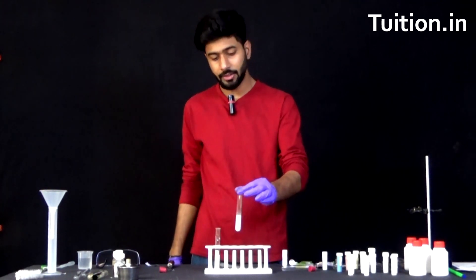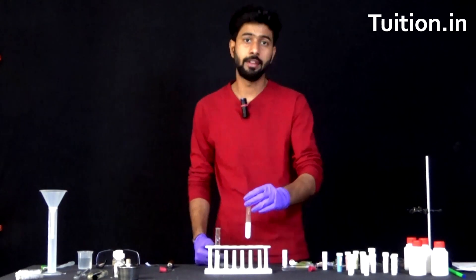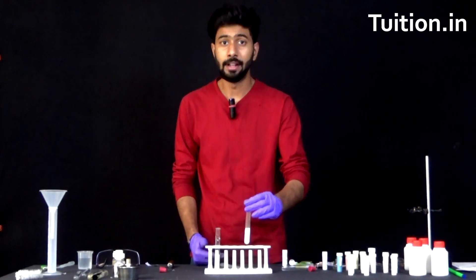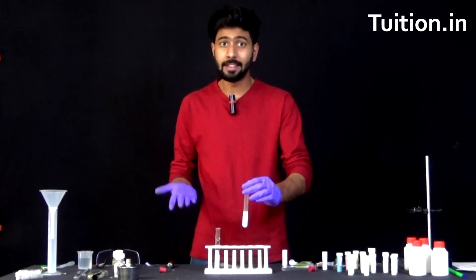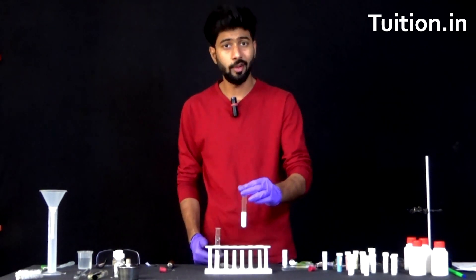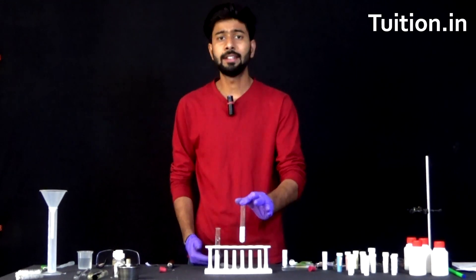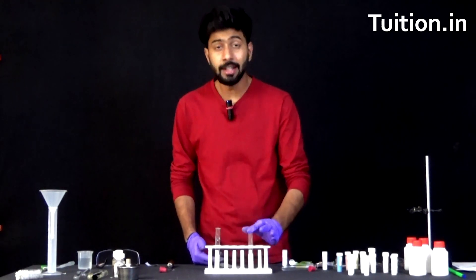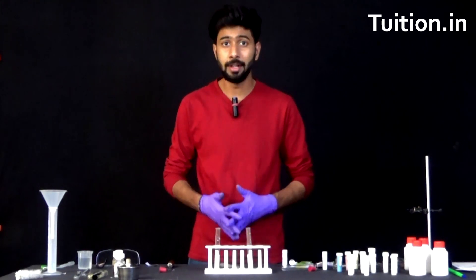As you can see, the solution is white and there is an insoluble white precipitate which is formed — that of barium sulphate. In this reaction, you had sodium sulphate plus barium chloride. The chloride ions in the barium chloride were replaced by the sulphate ions, and the sulphate ions in the sodium sulphate were replaced by the chloride ions. So there are two salts formed: one is the insoluble barium sulphate precipitate, and the other is the common salt, sodium chloride. Two ions were displaced, and that is why it is known as a double displacement reaction.